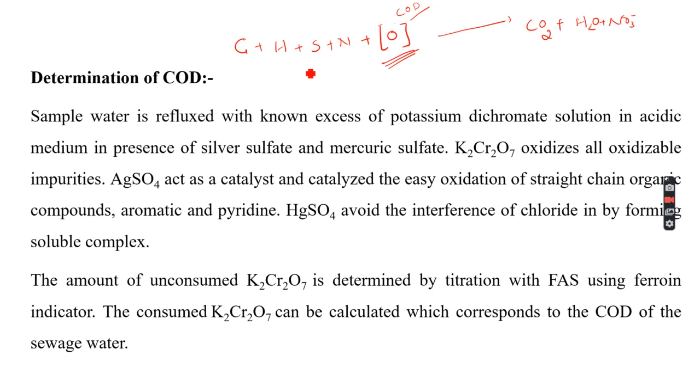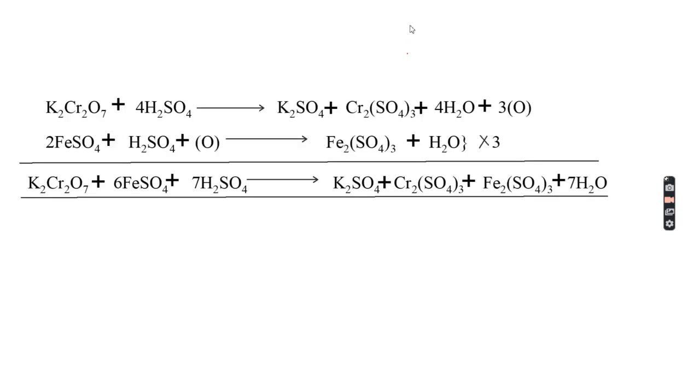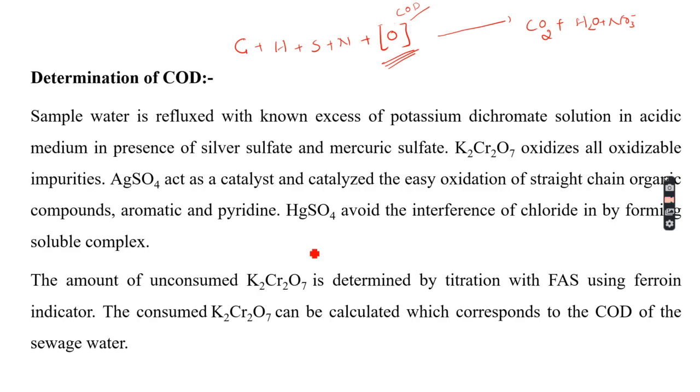Once the oxygen is trapped by these molecules, it will not be available for further reaction. So that's why we want to carry out one blank titration. We'll take distilled water in place of wastewater. Wastewater usually contains these components.